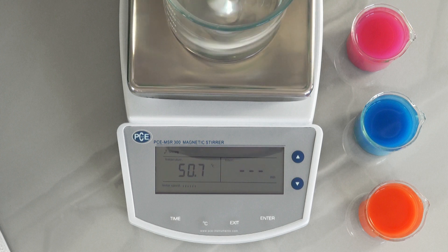The Magnet Stirrer offers the possibility, when needed, to set an automatic stirring time from 1 to 999 minutes. For this you must press the time key. On the right side of the display you then have the possibility to enter the minutes.